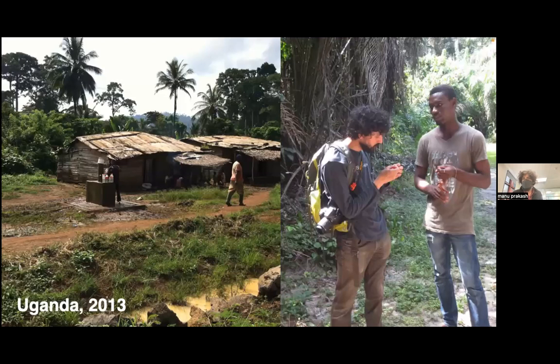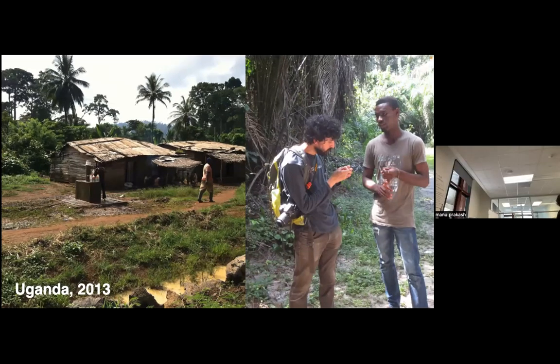Okay, so this was a setting where I stumbled upon this problem. This is one example of a centrifuge, a heavy motor that drives and spins something really, really fast. That's what the word centrifugation means. And if you have any density differences in the things that you care about, they would potentially start separating out. One example for that is what is called a QBC test, which I should have picked up.